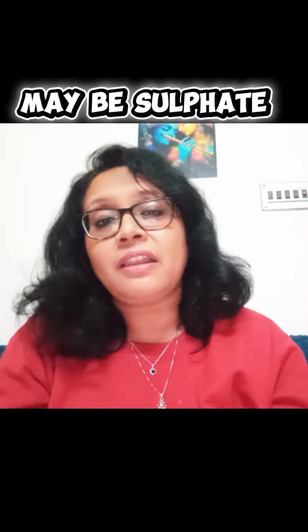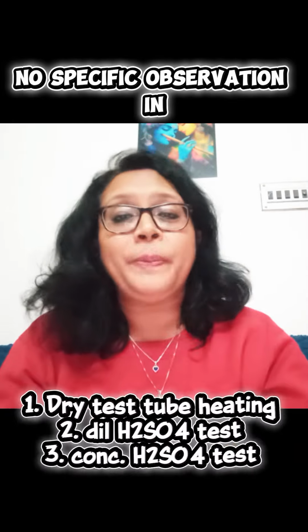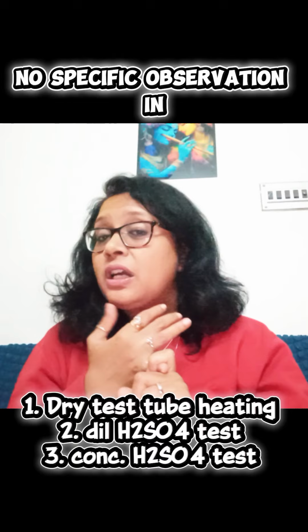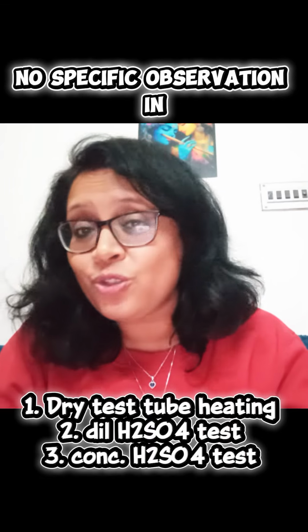acid radical sulfate. You know, when you are detecting the acid radical systematically, you have three things to perform. Number one is dry test tube heating to see what color fumes you are getting. Number two is dilute H2SO4. Number three is concentrated H2SO4 test. Suppose you are not getting any specific observation that is expected for all other radicals. That may imply that you may have sulfate.